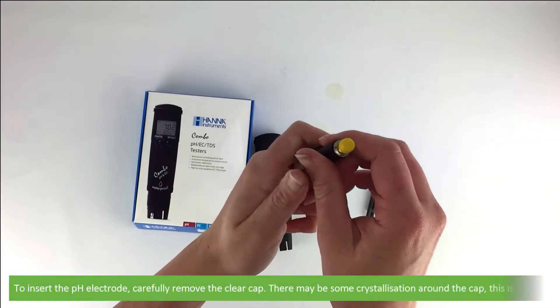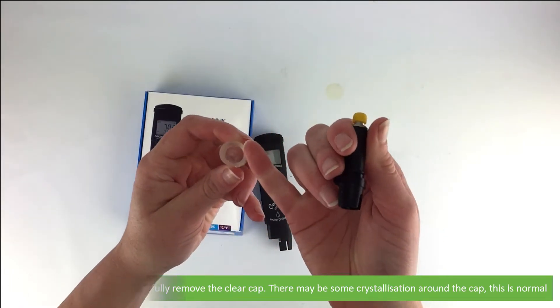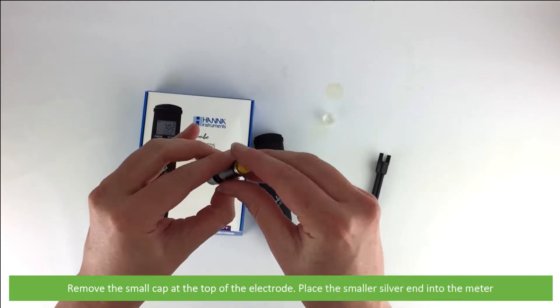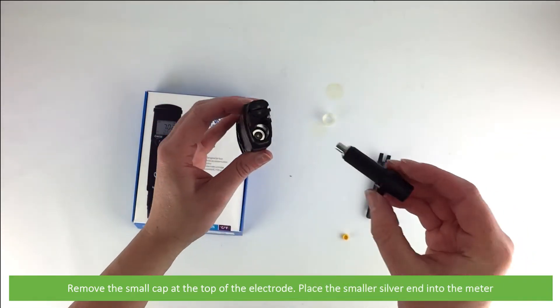To insert the pH electrode, carefully remove the clear cap. There may be some crystallization around the cap — this is normal. Remove the small cap at the top of the electrode, then carefully place the smaller silver end into the meter.